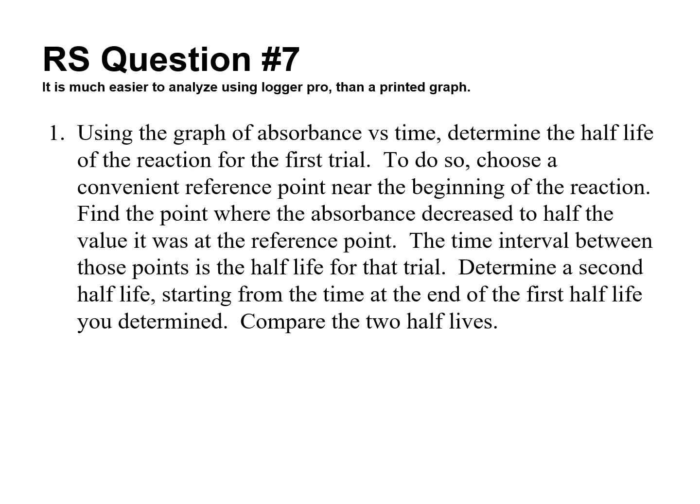And this is just telling you to use LoggerPro because it's going to be a lot easier to find the point where your absorbance is decreased by half, and then from that time again find the other half-life and compare the two values. So this should be sufficient information for you to adequately answer all the questions that you have for your report sheet in this lab.